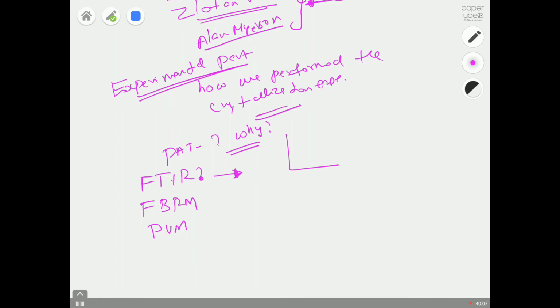So try to have a look, but you don't have to write the whole procedure that you saw in the YouTube video. That YouTube video is to keep you aware of how to do the experiment, how to play with particles, how to communicate with the particles, and how to get the information from the particle, and how to control the particles, and how to control the reactor itself, and how to connect the information that we obtained from different probes into one single window, using this iC control software.